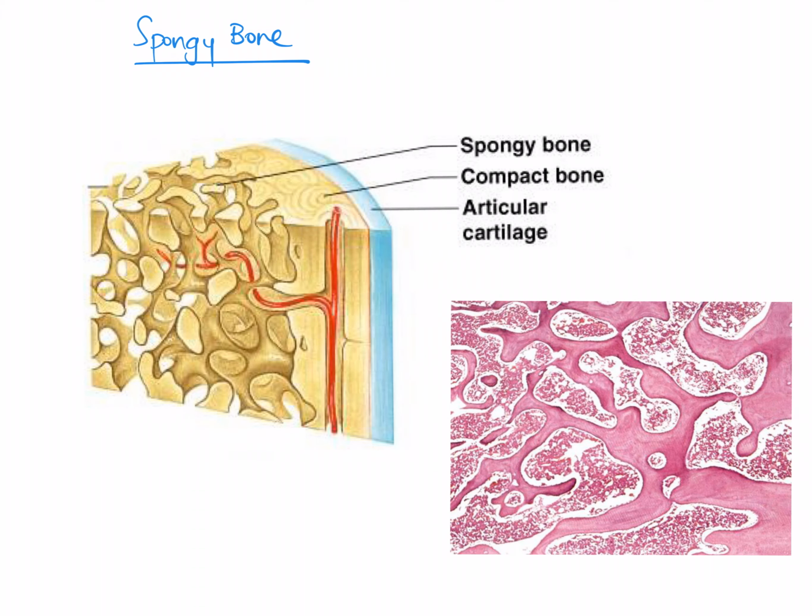Now that we've discussed compact bone, let's look at spongy bone. As we move, probably in any long bone, further away from the outside surface of the bone, from here where the compact bone is necessary to protect the bone, and move closer into the center of the bone, we get into an area of spongy bone that is intertwined with a lot of bone marrow, obviously housing red blood cells, stem cells, and other cells.